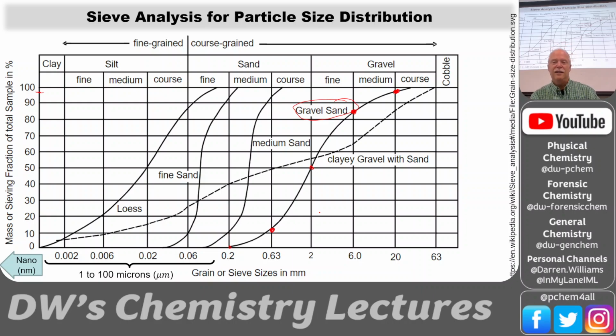Now, I have to say this just because we had a technician that totally wrecked this behavior. In the top sieve, they were trying to analyze the powders, an explosive powder. On the top sieve there were some really big chunks, what I call pickers, and they picked those out with tweezers because they were focused on the powder. Don't pick out the pickers. Leave those in there. That's part of that most coarse fraction. Those are the rocks and the gravel, and that's part of the mass. You don't pick out any of the mass, and our numbers just weren't working right.